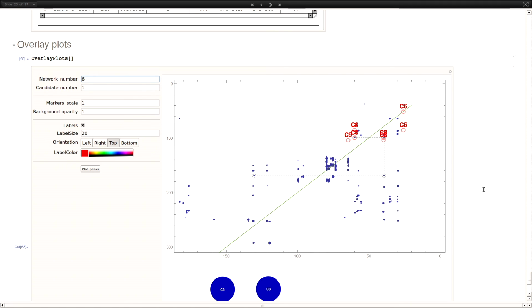Do you have intensity for the spectra as well? It's not the case, right? Say again, sorry. Do you have intensity? In this case you could say which are the dominant ones, right? Yeah. Like I said, I don't remember quite well, but I think this mixture has like 20 compounds or something, and this one detects 10. So from the paper, we got that it gets around 60% of the networks. So, I mean, it's a useful number. I remember from my studies there were a lot of peaks.